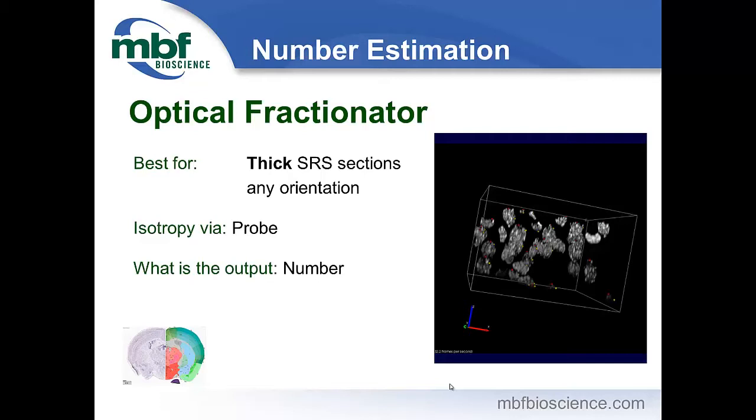You don't have to use the vertical or the isotropic sectioning, and that's why we put this icon of an atlas picture in the lower left, which means you can section the tissue any way you want, the way you're used to looking at it. Right, and the thick sections actually make it efficient too.